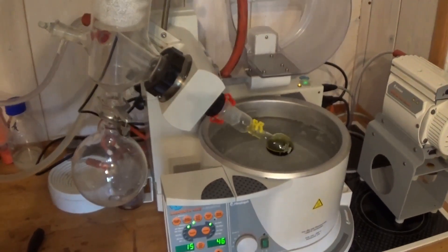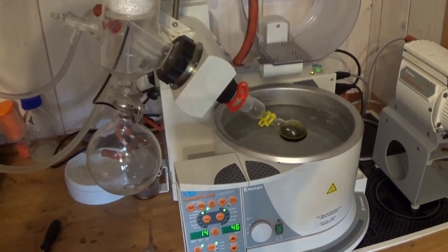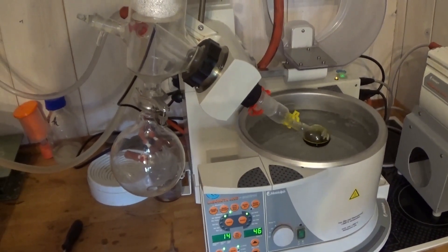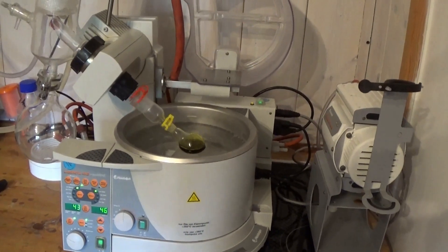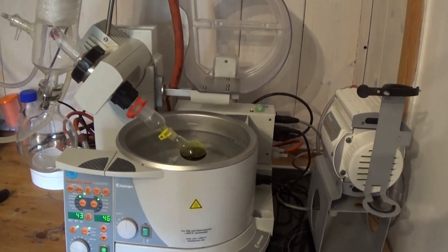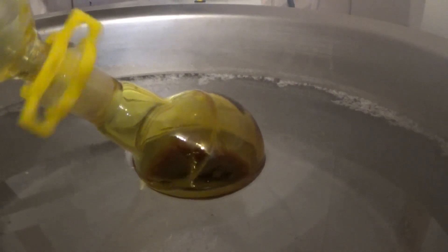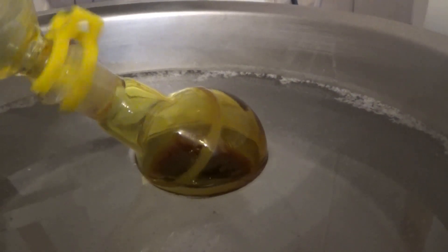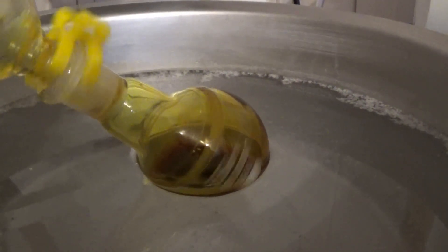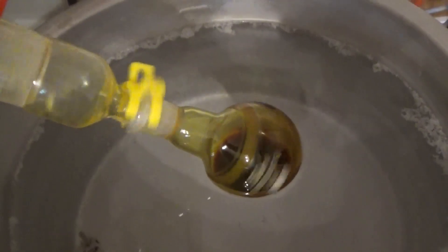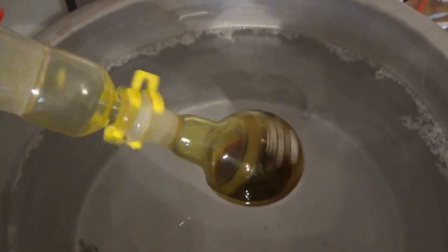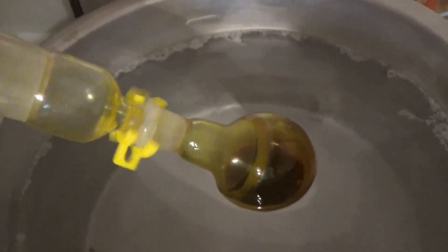I will explain the roti, that's how we call the rotational evaporator where I live, in another video. But for a short explanation, the whole system operates under vacuum and due to the spinning motion of the flask the surface of the liquid is increased drastically. This leads to a very simple and easy to operate distillation of solvents.